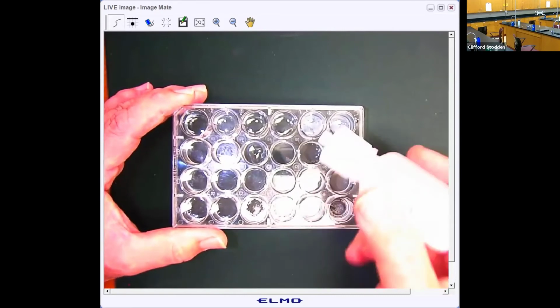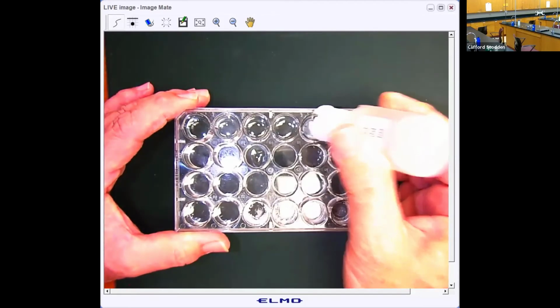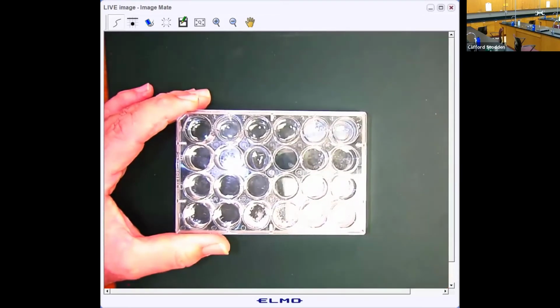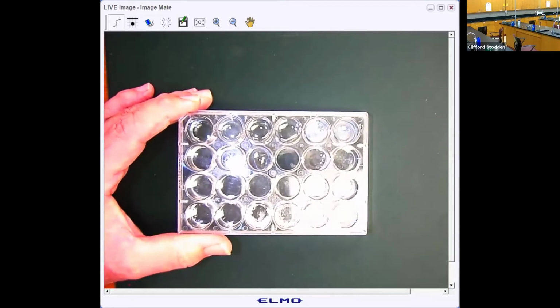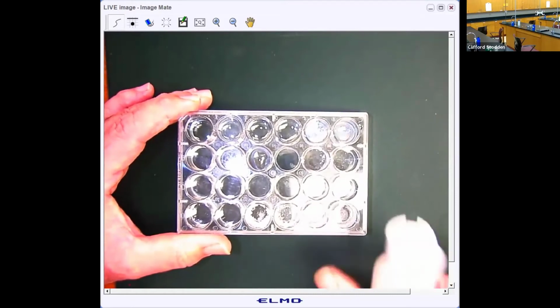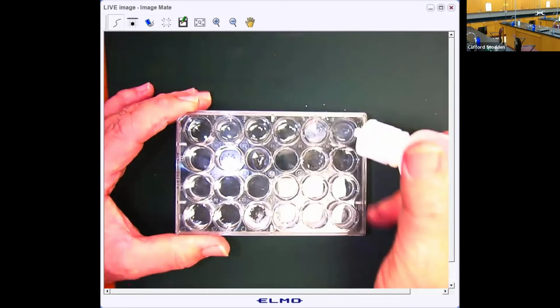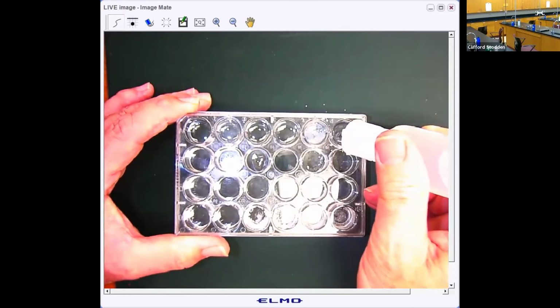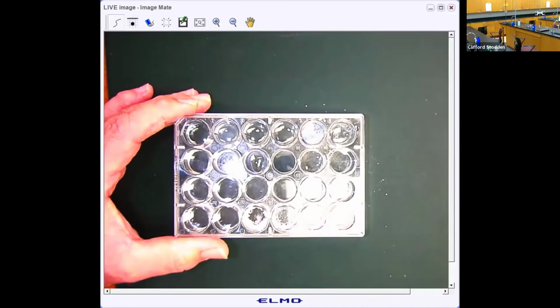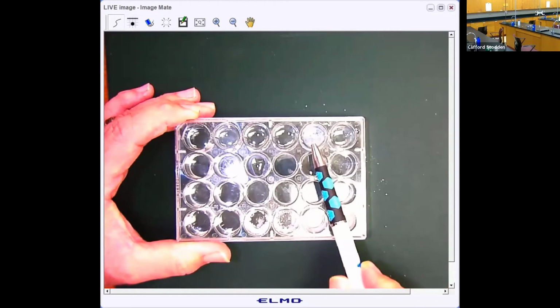So I'm going to take the ammonia and bump that up to 10 drops. And it looks like there's still a precipitate there. I'm going to take the sodium hydroxide and add more of those as well. Okay. Look what happened with that. This one actually got cloudier.